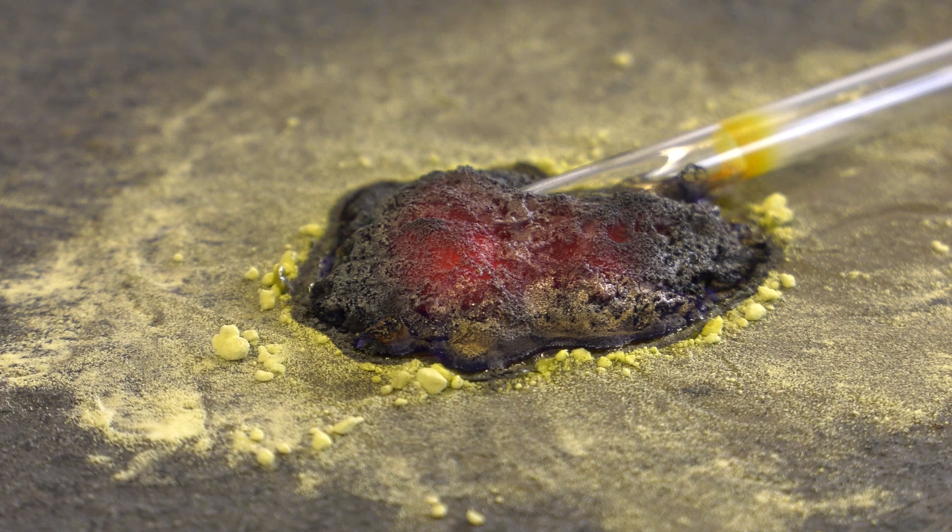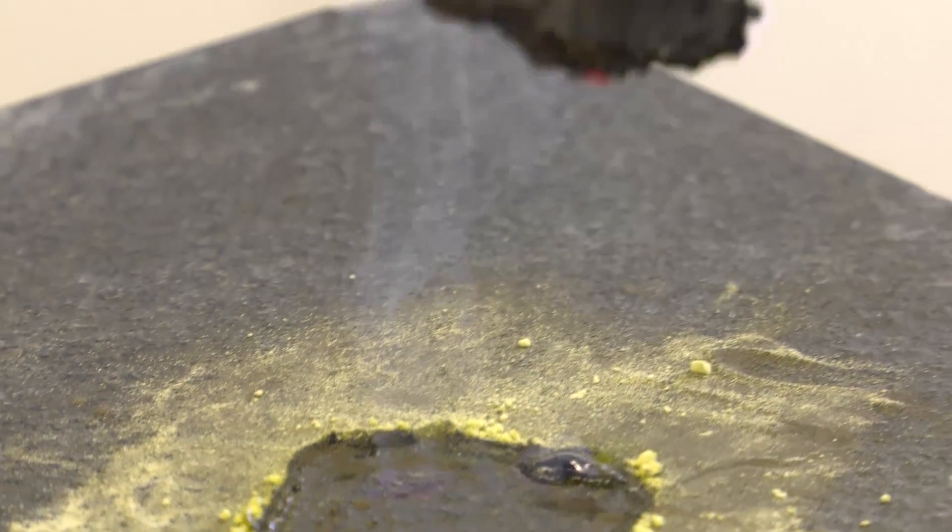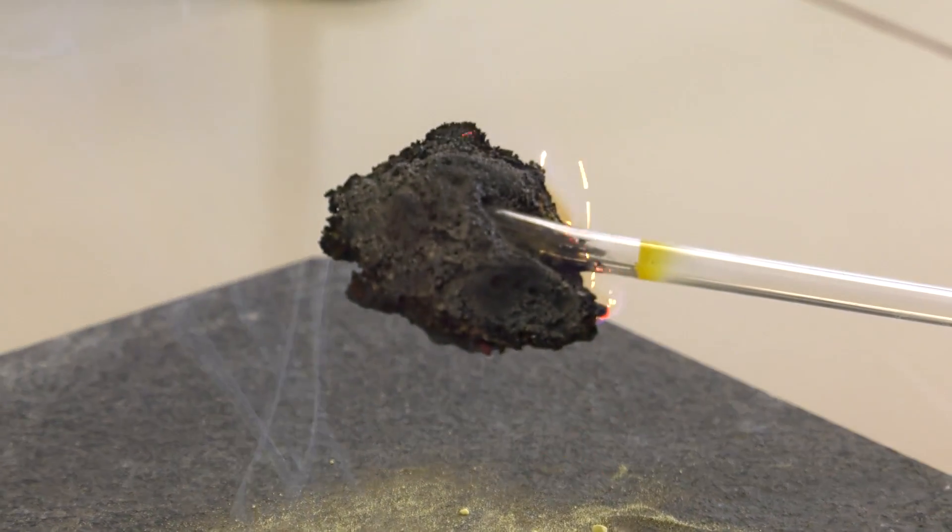The result of this experiment is iron sulfide, a black and gold colored cluster. Iron sulfide is also known as pyrite, marcasite, or fool's gold. The cooled product can be disposed of in the household garbage.